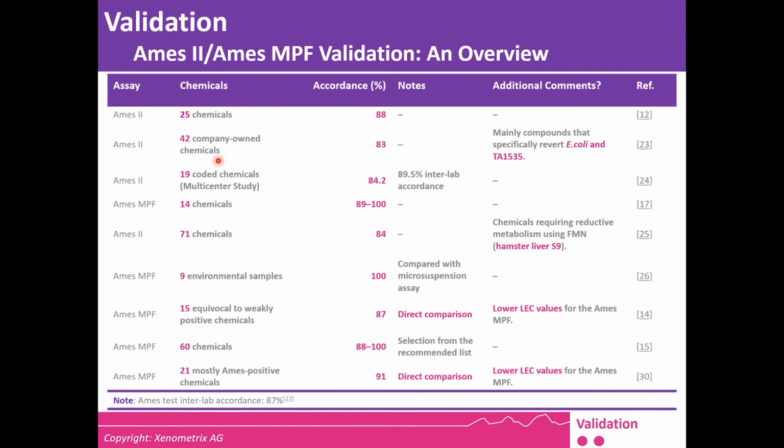But as you can see here, using company-owned, coded chemicals for a multi-center study, and environmental samples, the accordance is always pretty good. In any case, normally higher than the published Ames test interlab accordance.